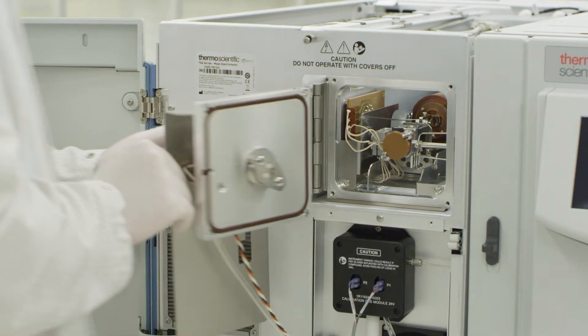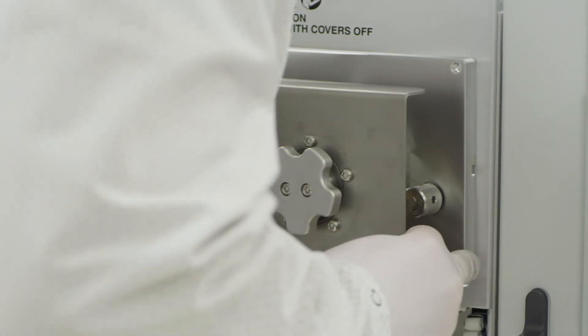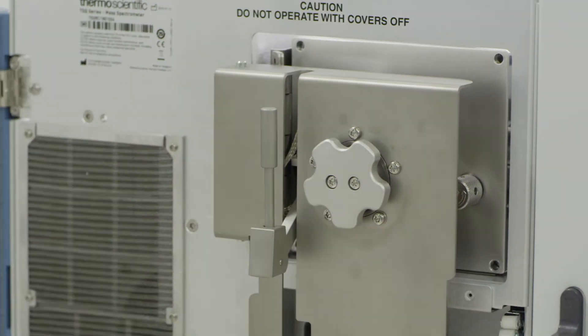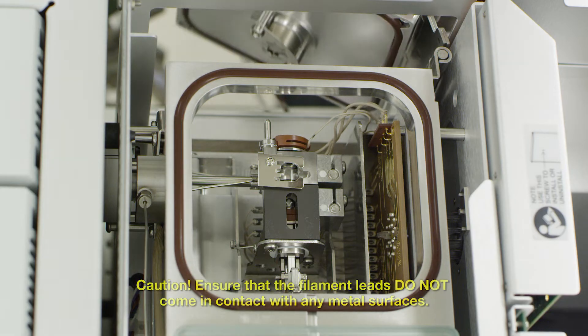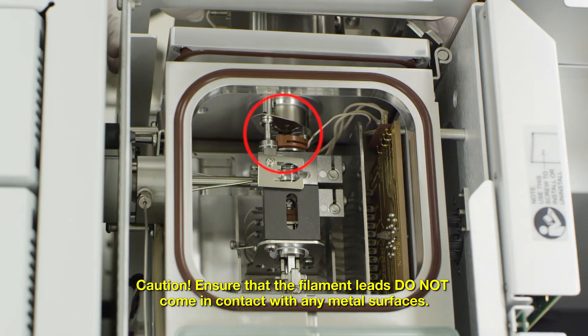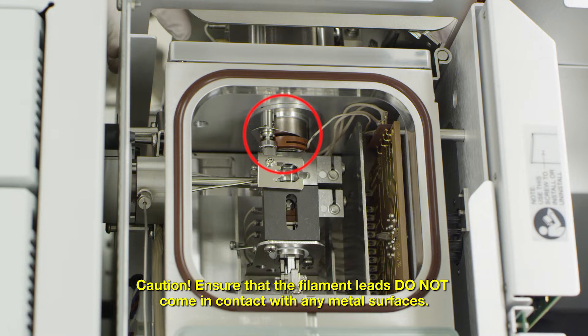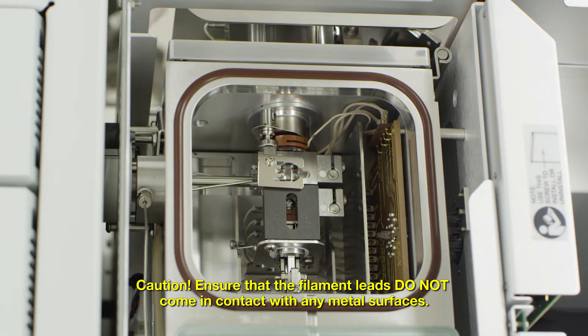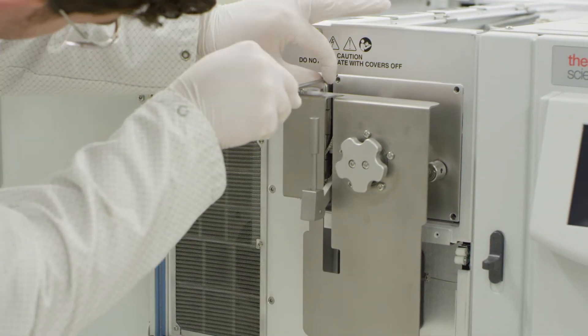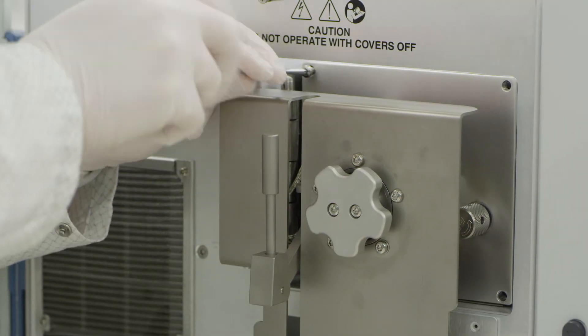Replace the manifold door in the opposite way in which it was removed. Swing the door in and push the door straight in. When pushing the manifold door back onto the assembly face, ensure that the alignment posts are aligned properly. Never force the manifold door or any part of it to fit.